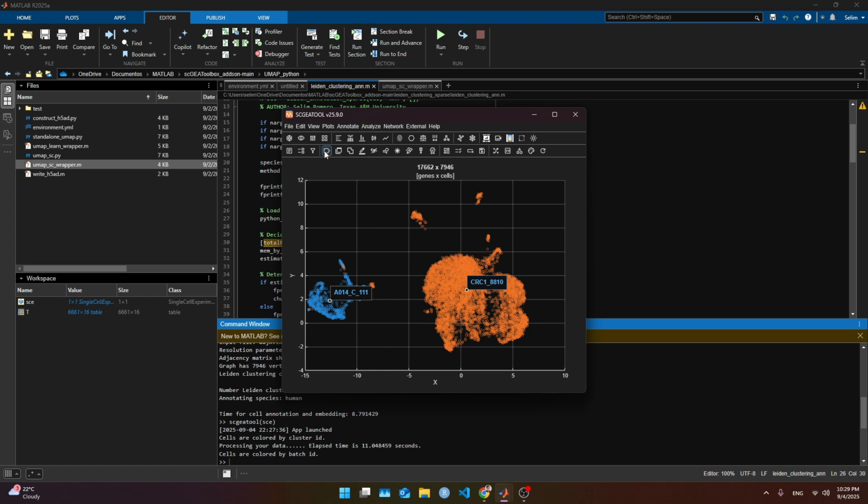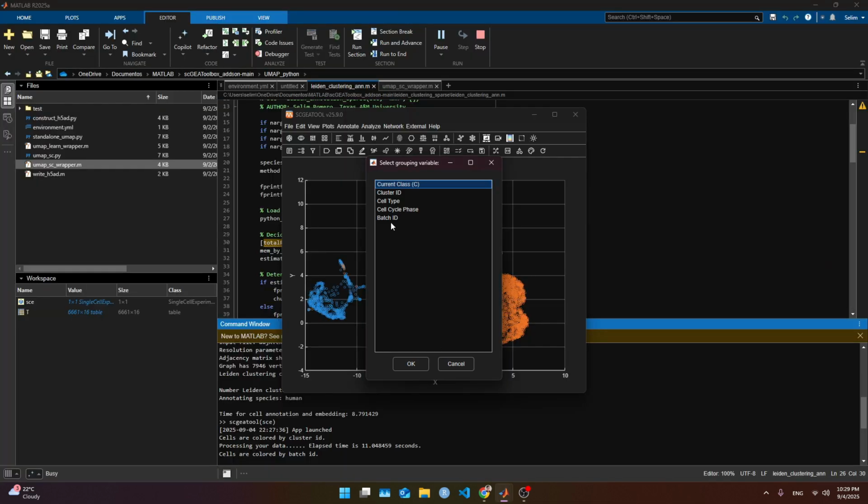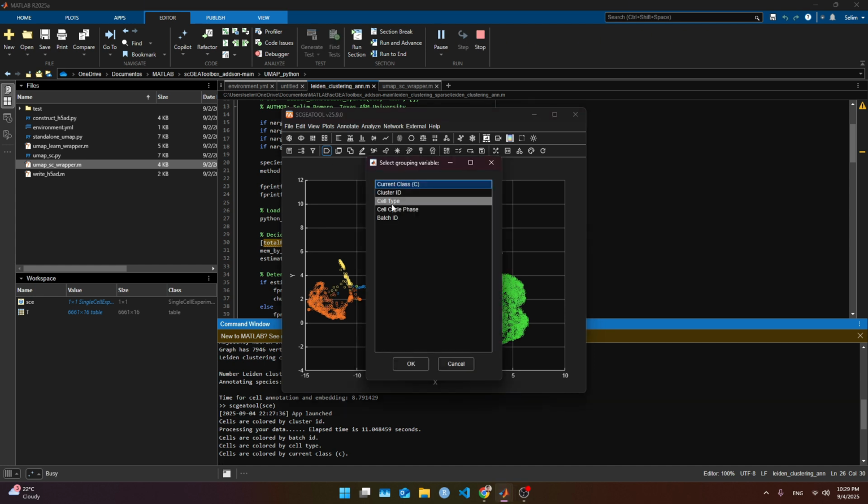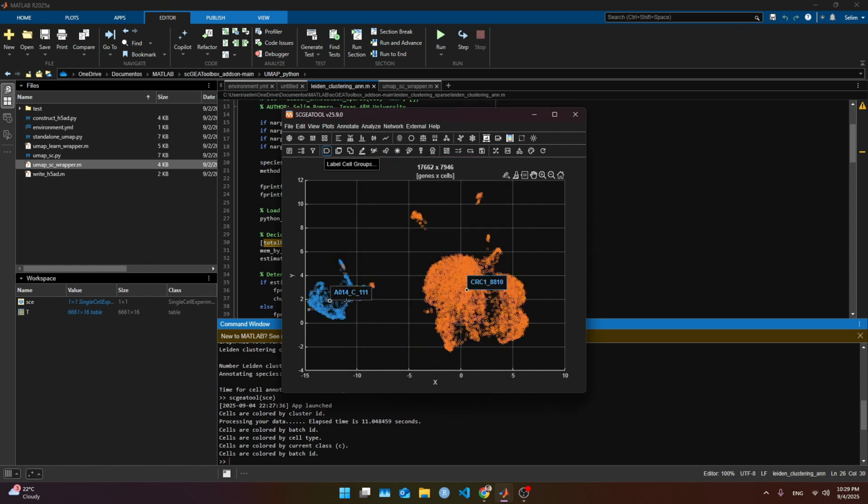So we look for cell type again, and right, that's what happens. I'm having some little issues with this. I can repartition and reannotate all the time. So it seems it's going to be hard to compare the two samples because I need similar cell types.